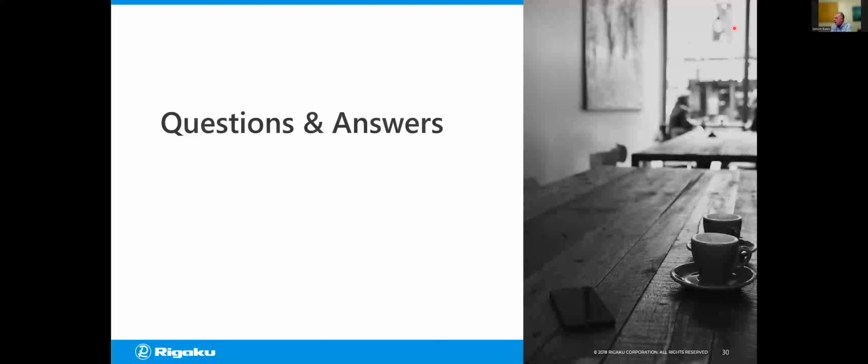Yeah. That's always a challenging situation, but again, it's not that uncommon when dealing with organics. A lot of them are metastable and they'll change during the measurement. So what we usually teach people to do is take snapshots. Most of our systems come with either a linear or an area detector, and we try and teach people to take very rapid snapshots. In that case, you put the sample in and maybe you take 10 snapshots in a row, and then we have a software called the cluster tool, which will look at that and will segment it into data that represents the same type of material.